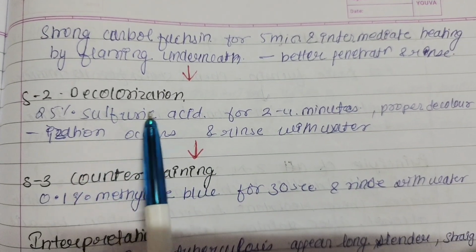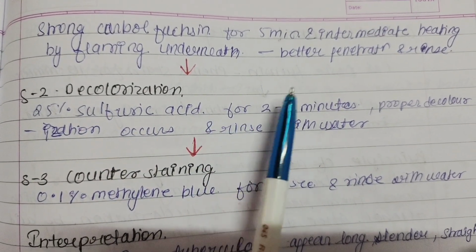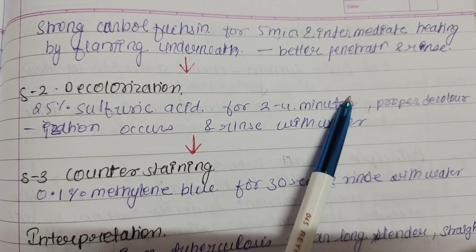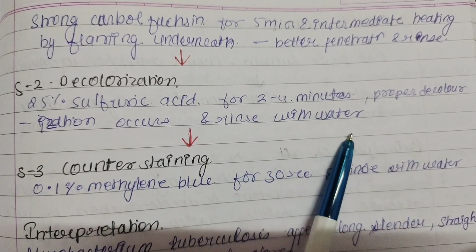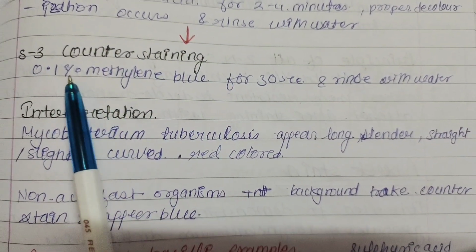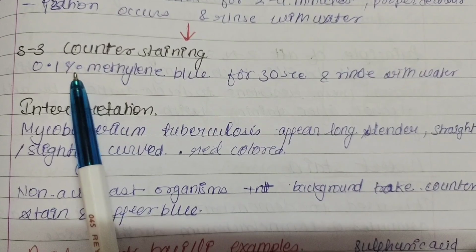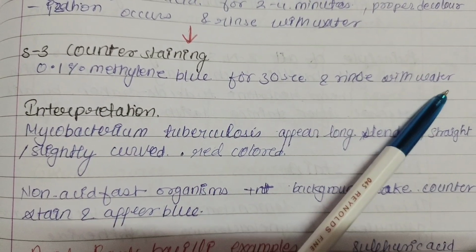Now in step 2, decolorization, in which 25% sulfuric acid is used for 2 to 4 minutes. It is placed on the slide, proper decolorization occurs, and it is rinsed with water. Now step 3 is counter staining, in which 0.1% methylene blue is used for 30 seconds and then rinsed with water.